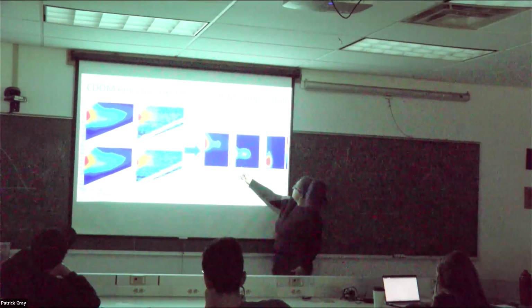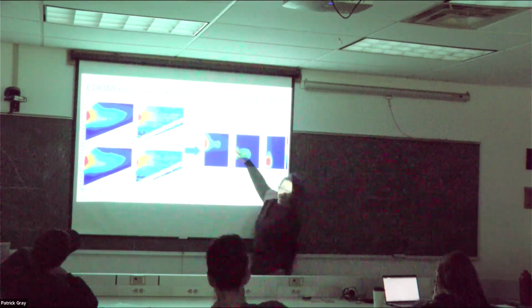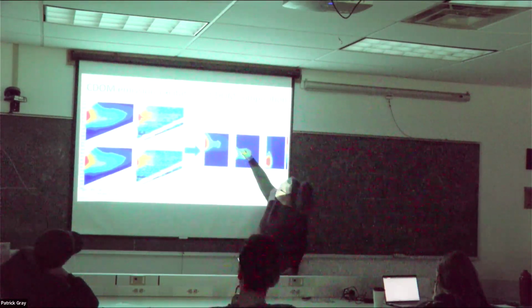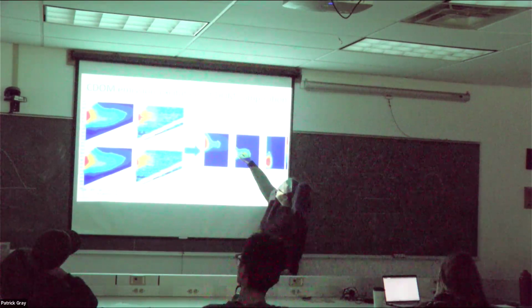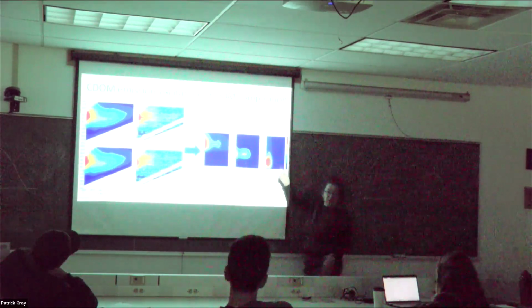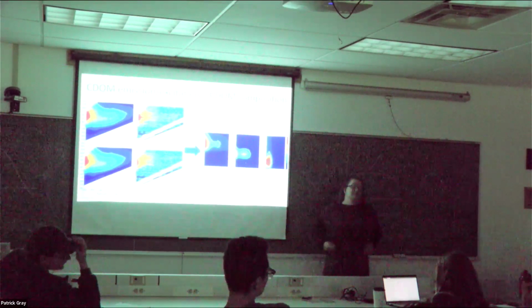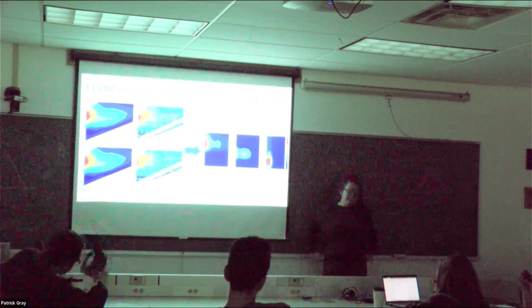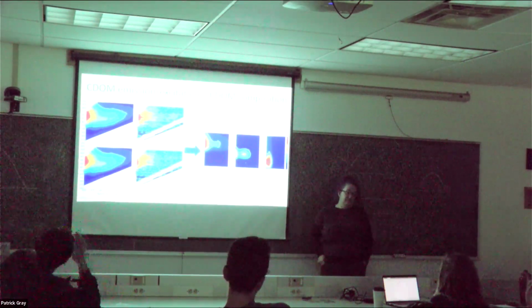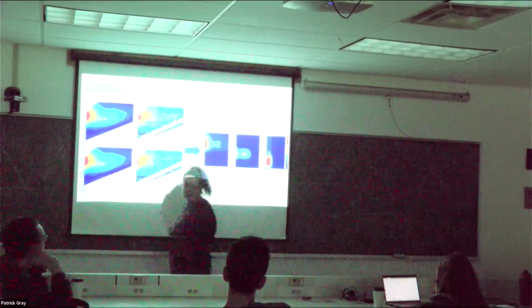So you could sit somewhere around 270 and use really narrow detection filters. I would put a detection filter up high here, and somewhere really low here, to separate these three substances. You'd compromise the intensity of the excitation for the instrument design, so that you're using only one excitation. Yes, exactly.